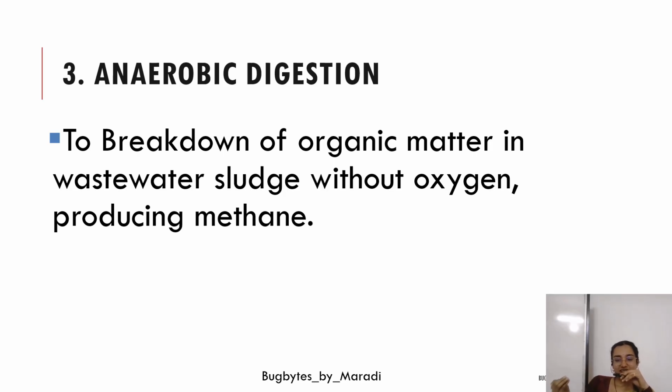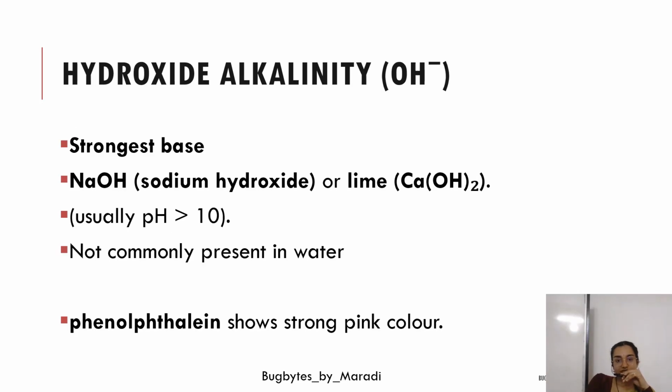It mainly aids the operators in determining the correct chemical doses of calcium carbonate or whatsoever, and prevents pH imbalances in the water, and ensures stable as well as efficient operation, so you will get the proper results. So we'll start with, I have already spoken about hydroxide alkalinity, carbonate alkalinity.